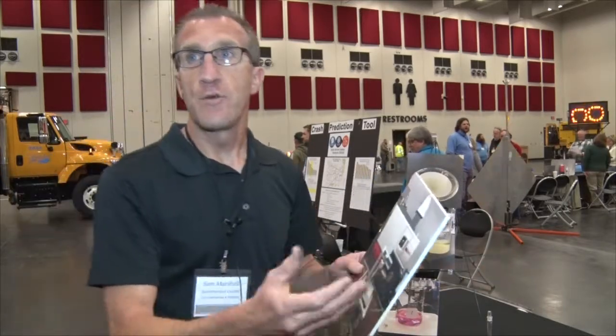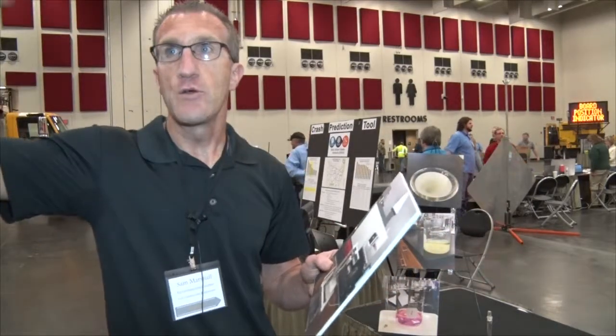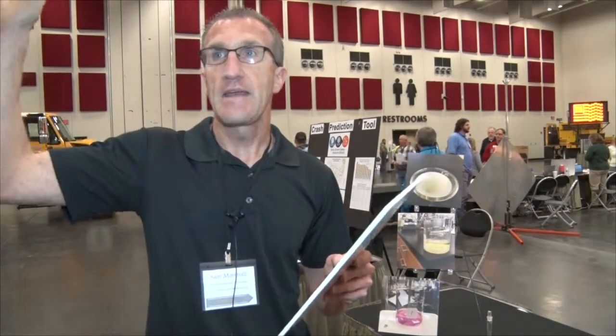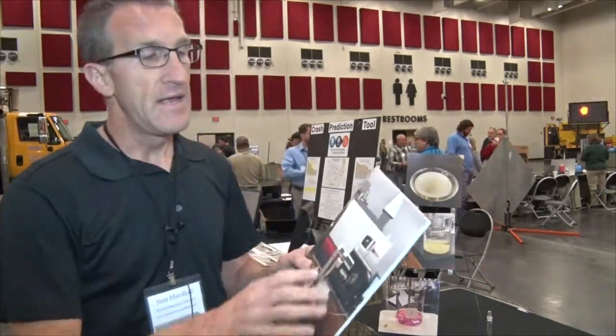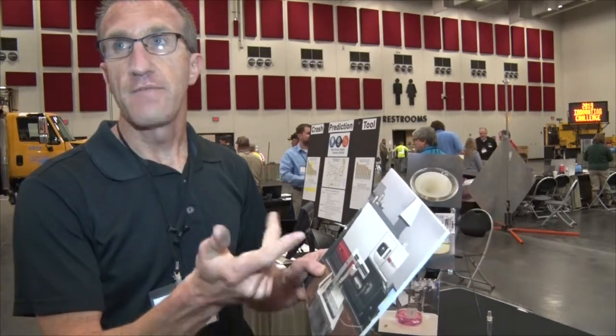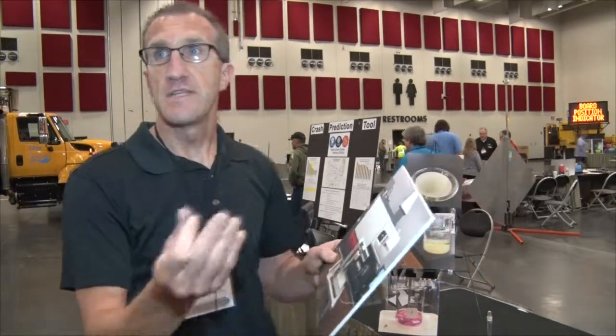The reason that I don't use aluminum oxide when I fuse the sample and put it in solution is because I don't have a high aluminum oxide standard to bracket. So if I analyze it, I can't get a true result. That's why I use this emission spectrometer to get silica, iron, phosphorus, and titanium, and I subtract that off, and the difference is aluminum oxide.